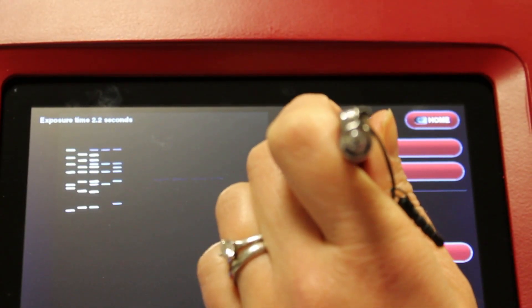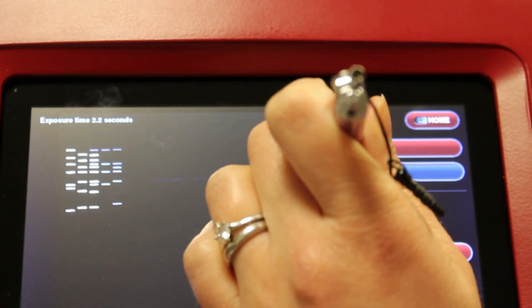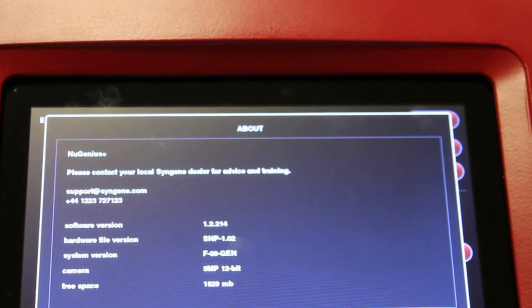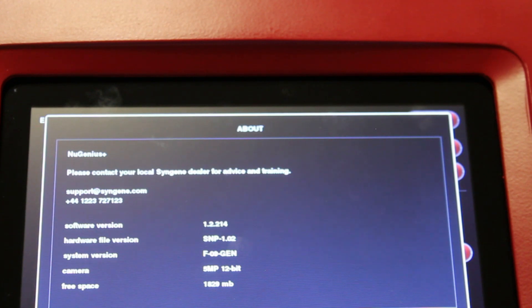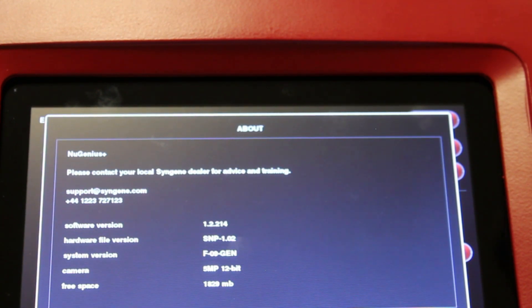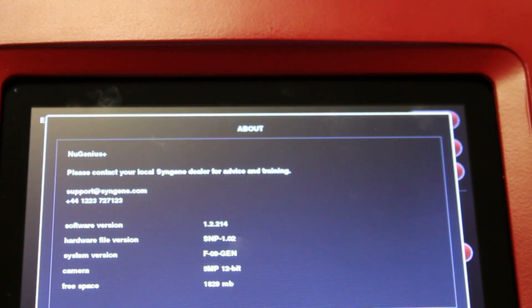The about button contains useful information about what software version you are currently using, and also how to contact Syngene if you have any support issues.